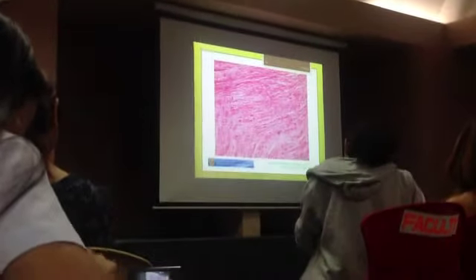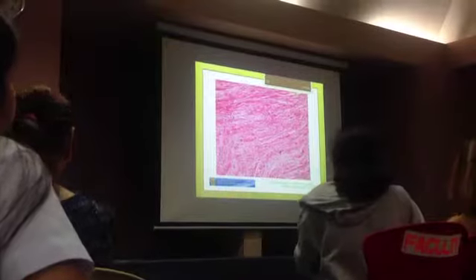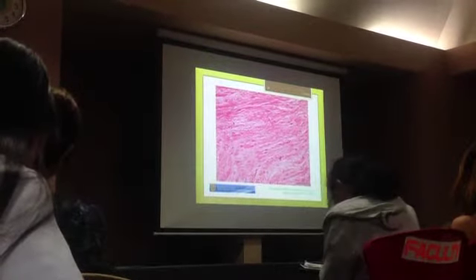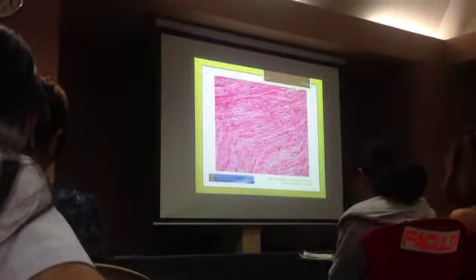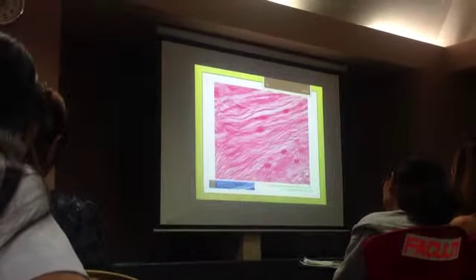Predominantly, you have many fibers in the matrix. And this is from your intervertebral disc.